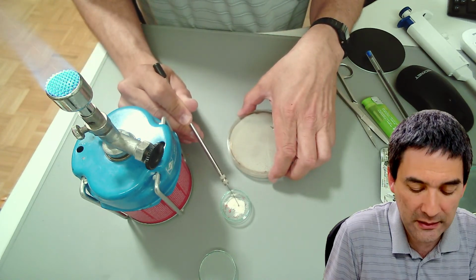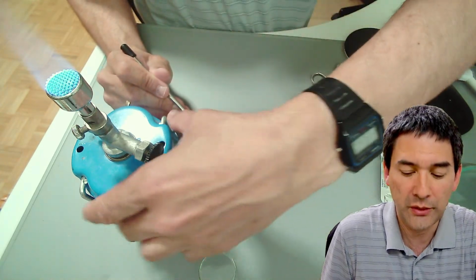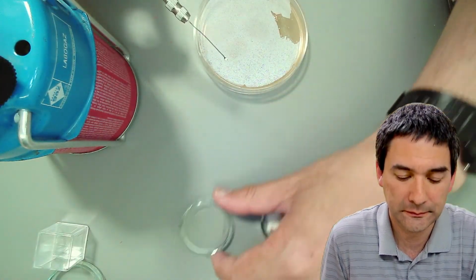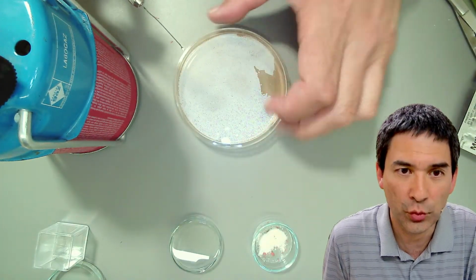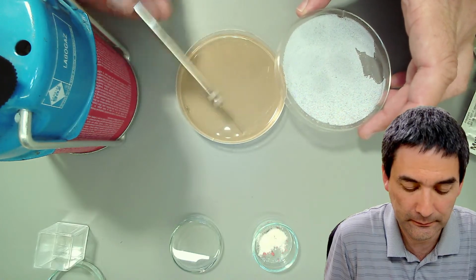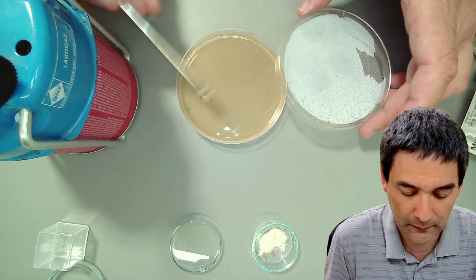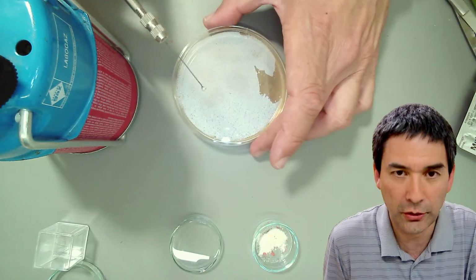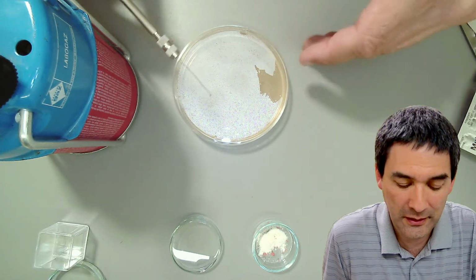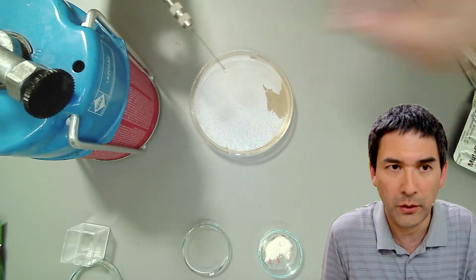I'm now going to take some of the bacteria here, and I'm going to start streaking. And you know what I'm going to do now is I'm going to probably put the camera down a little bit more so that you're able to see it better. Okay. There's a little bit of condensation water here on the lid. Okay, so what I'm doing right now is I'm going to start streaking. You don't want to talk while you do that, because otherwise you're going to blow bacteria and air on it. And now I'm going to glow it again to kind of kill off all of the bacteria.